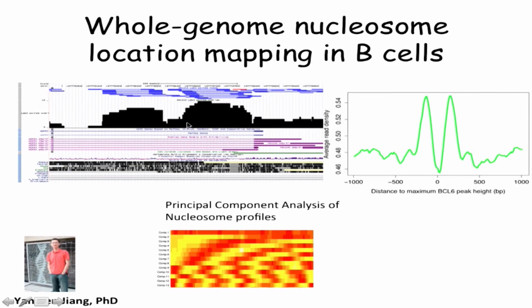But these are actually single nucleosomes here. This is using paired-end sequencing of the two extremities of the longer DNA fragments. And you have an accumulation of these reads here that map to the same location, and that basically marks individual nucleosomes. So this would be one nucleosome here, another nucleosome here. And I always found this really cool because this is almost like a microscope, right? You can basically see the nucleosomes on the genome. You can see the valley here between two adjacent nucleosomes, right?